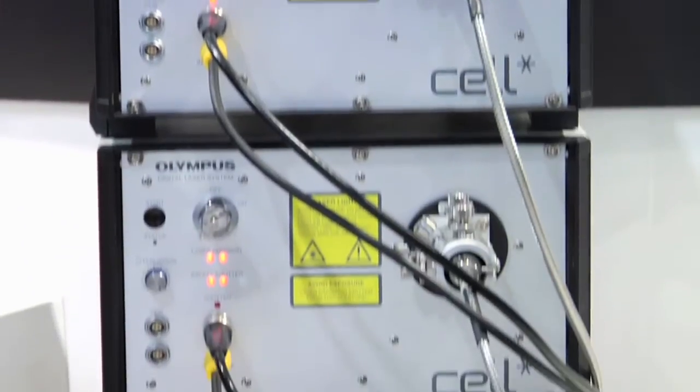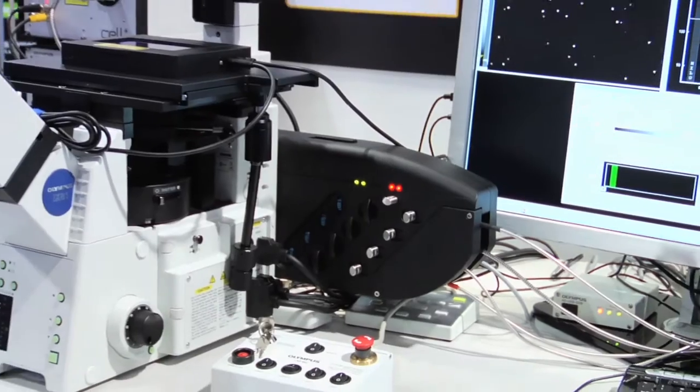Each fiber still comes in individually, as it did with our two and three-line systems. That allows us to have individual control of each of the wavelengths. Something that is important for TIRF is that the different wavelengths at similar angles have different penetration depths. We want to be able to make sure that we have the same penetration depth for each wavelength. And therefore, having each wavelength delivered individually and having individual control of that means that this is the only illuminator that can allow you to simultaneously do multiple colors. And in the case of this system, up to four simultaneously.